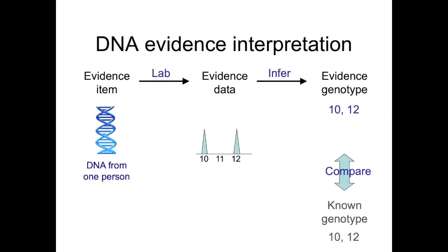Next, we talk about DNA evidence interpretation. And the idea is to show that the interpretation of simple DNA is conceptually the same as interpreting very complex DNA. Let me show you how.